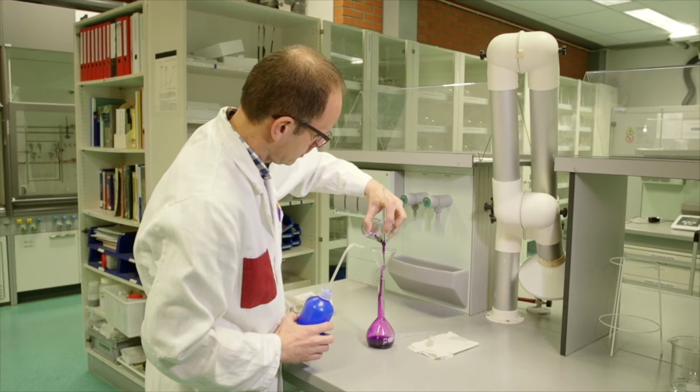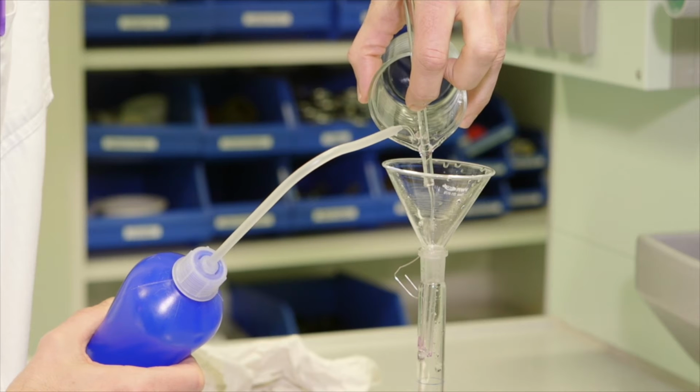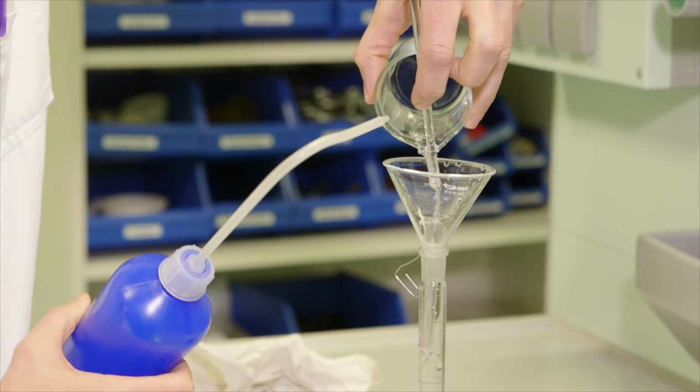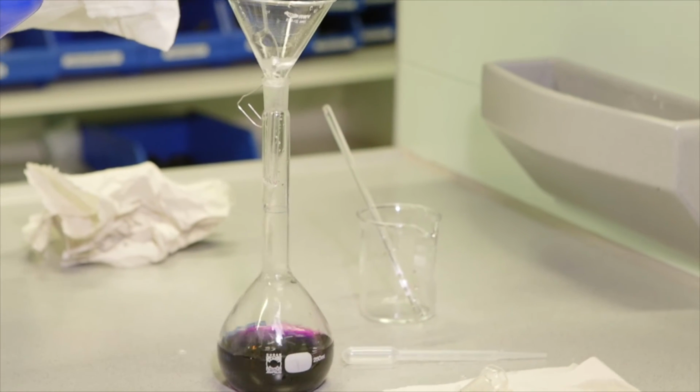The liquid is transferred in a smooth motion into the funnel. The beaker can be rinsed 3 times with demi-water, and then the stirring rod and the funnel can also be rinsed. Ensure that not too much liquid is added because otherwise the flask will be too full.